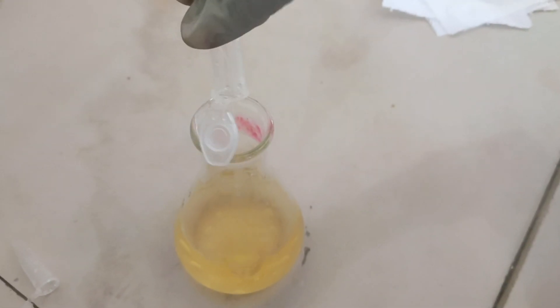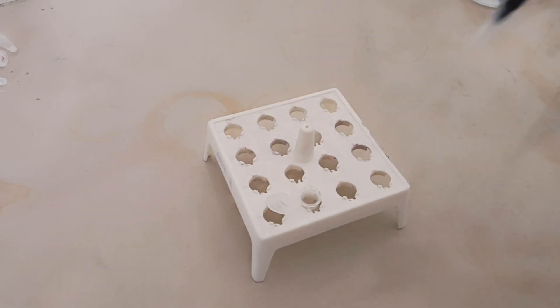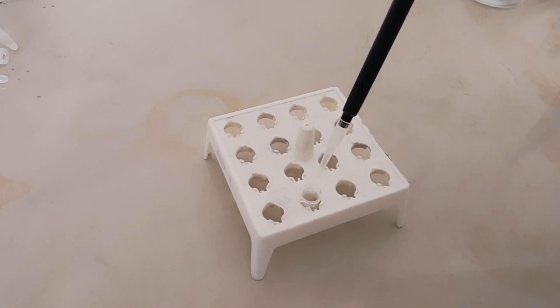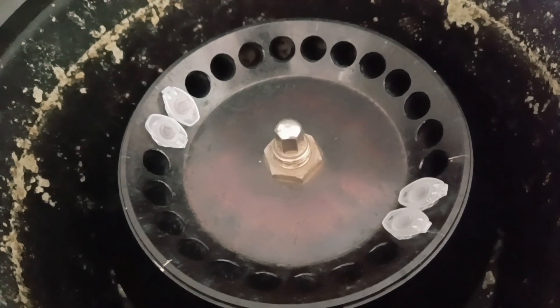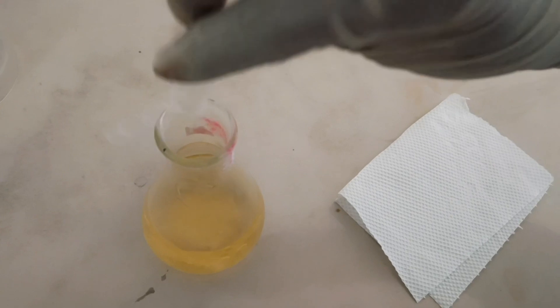Decant the tubes. Add 200 microliters of 70% ethanol. Centrifuge the tubes at 10,000 rpm for 1 minute. Decant the tube and dry the pellet.